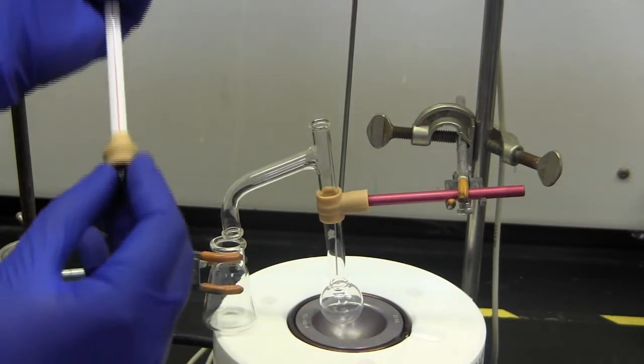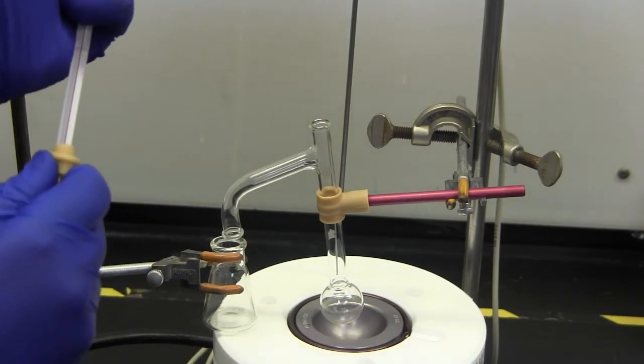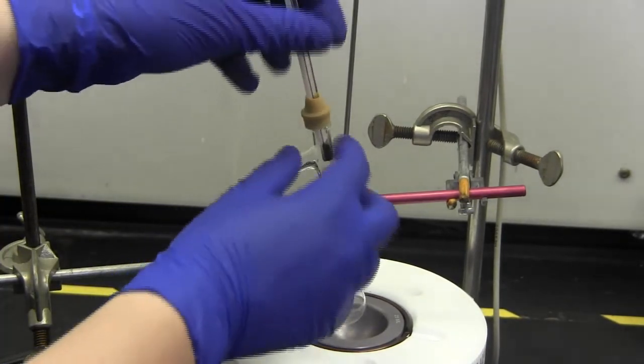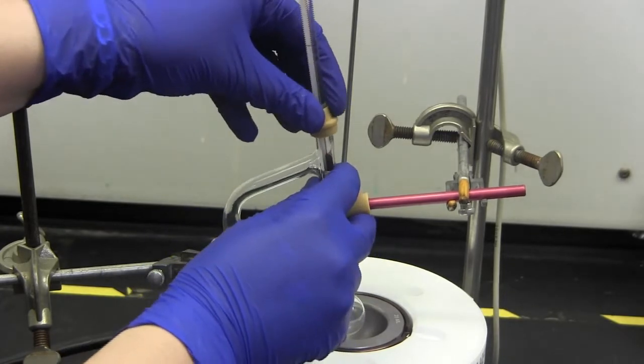Carefully insert the glass thermometer through the top opening, using a rubber fitting to make sure it is snug. The thermometer's tip should be about where the branching setup occurs.